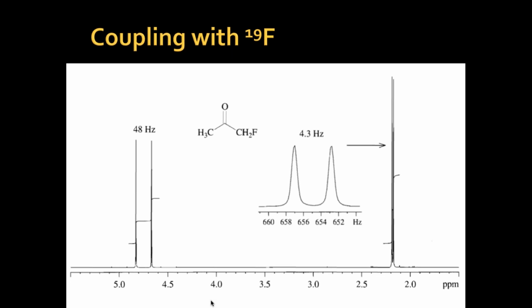For the 19F isotope of fluorine shows NMR, fluorine NMR, and it participates in the coupling as well.